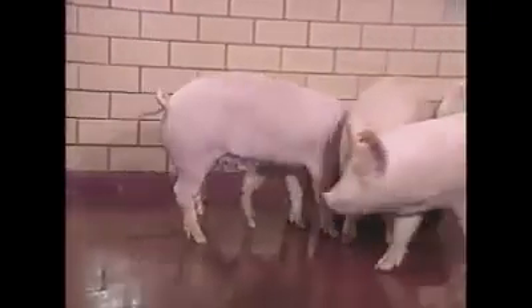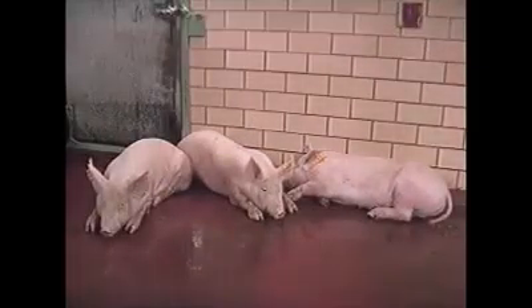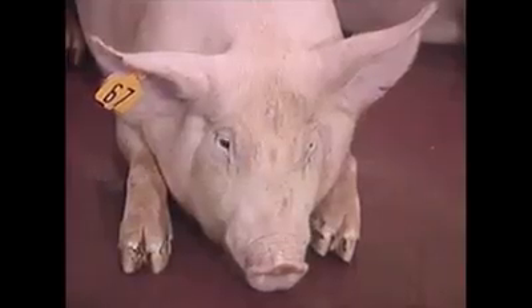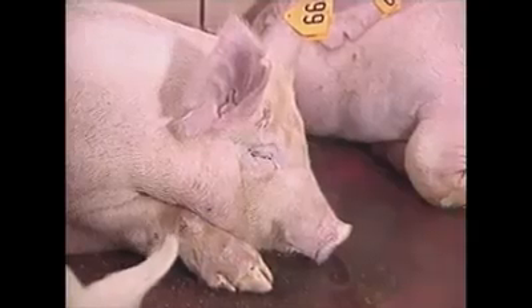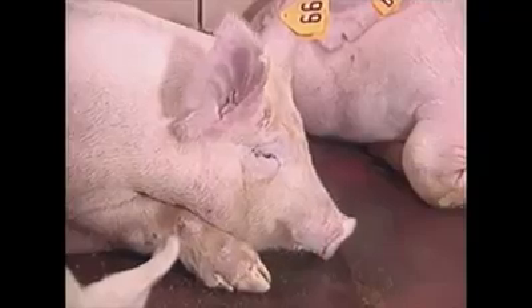The other pigs are still normal. All the pigs are now depressed and do not want to get up. Note the coronary bands on both front feet. This is the pig that was lame two days earlier. The vesiculated coronary band on the left claw has ruptured. The coronary band on the right claw is vesiculated, and the hyperemia is prominent. On another animal, note the blanching of the coronary band. This stage is similar to day two for the inoculated pig.